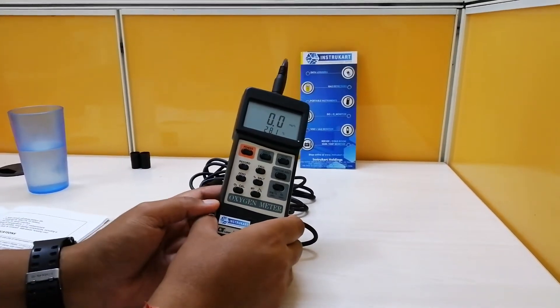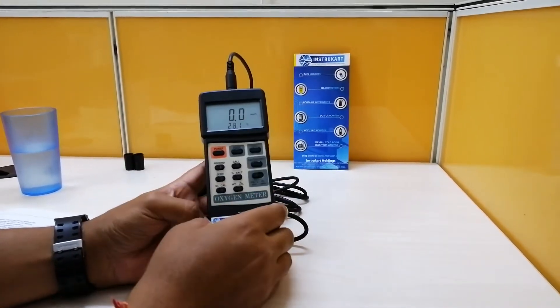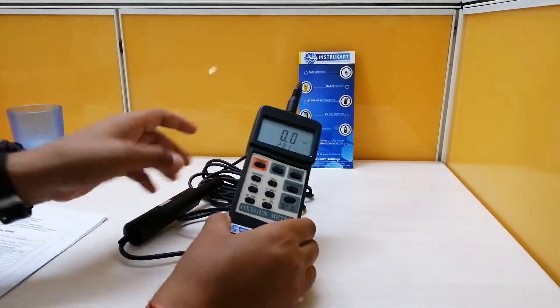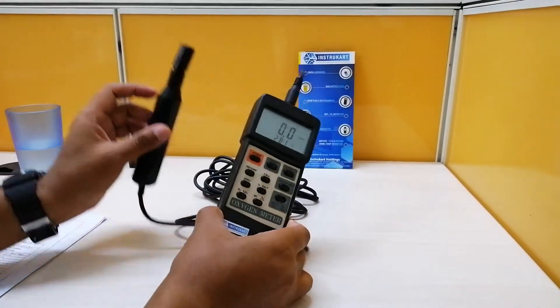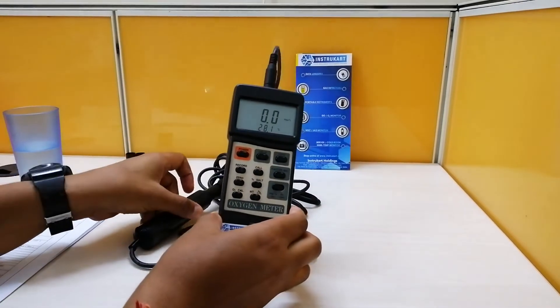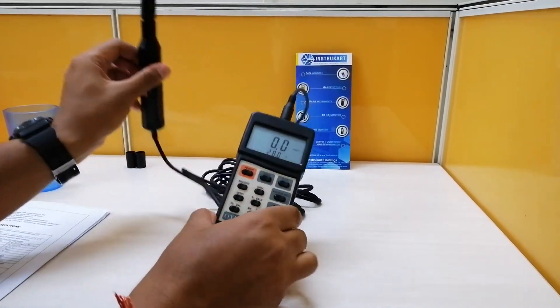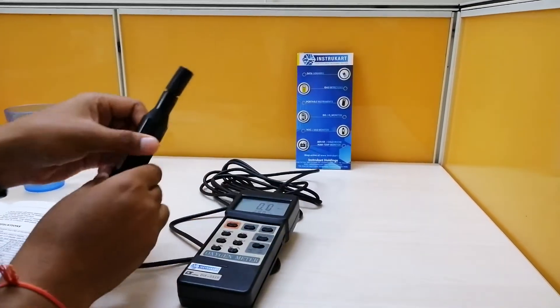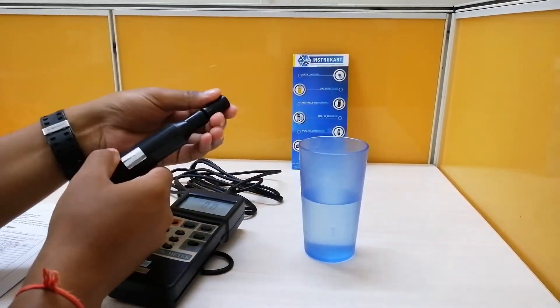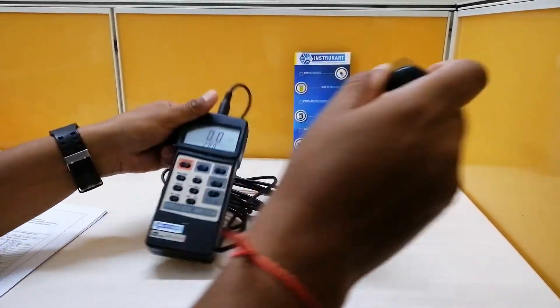You also have probe compensation and adjustment, and there are front keys to toggle between functionalities. I'm going to demonstrate how we use the same probe for both DO and oxygen. I've set the meter to mg per liter, which means it is ready to capture dissolved oxygen. I've taken a glass of drinking water, opened the cap, and will check if the reading changes.